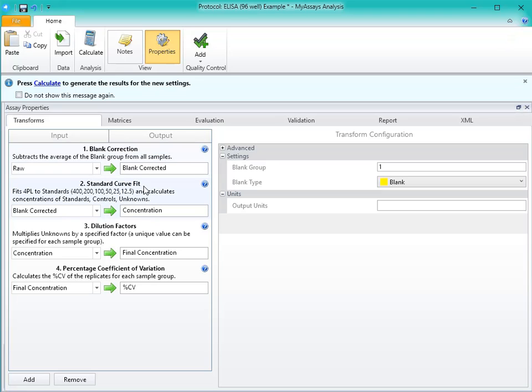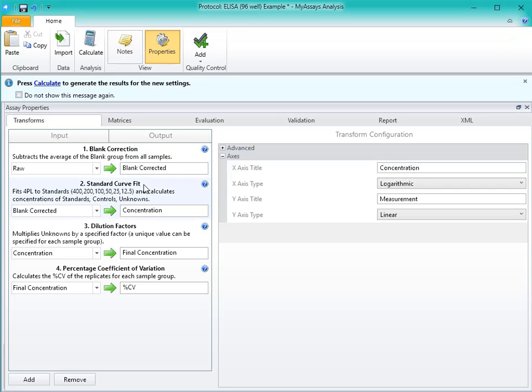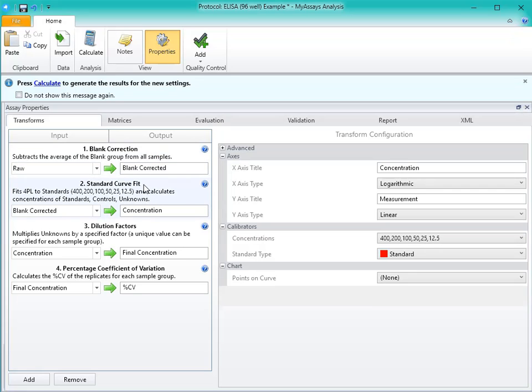Next, we'll see the Standard Curve Fit Transform. This will plot the raw results against the defined concentrations using a specified curve fit to interpolate the concentrations of the other samples, like your controls and unknowns.